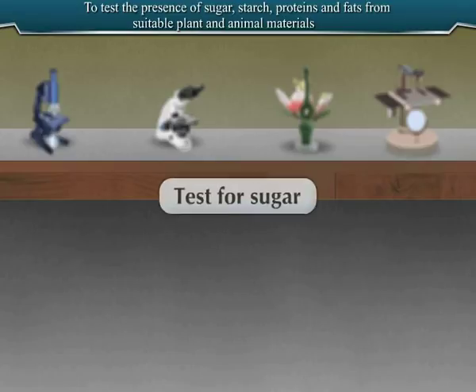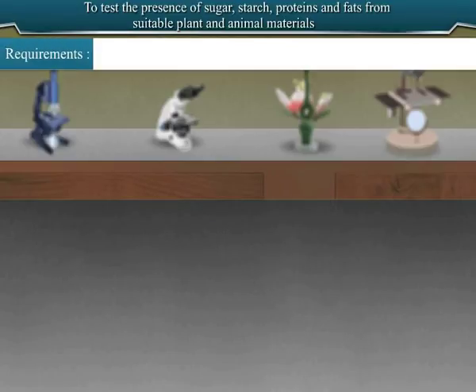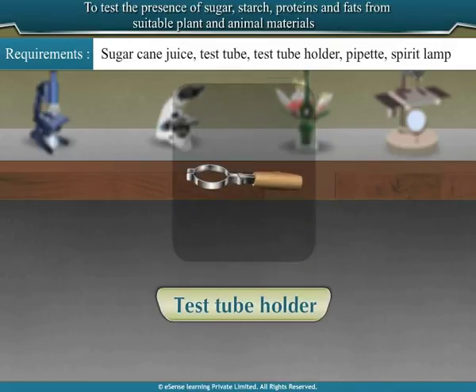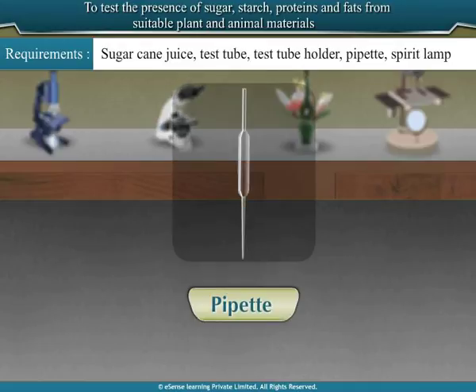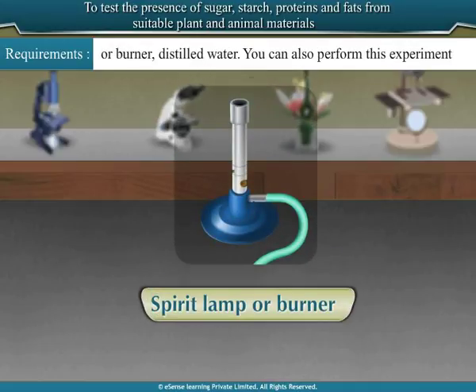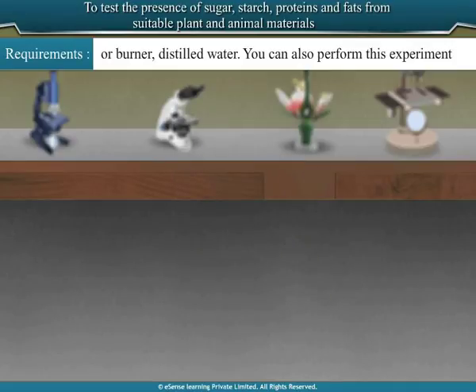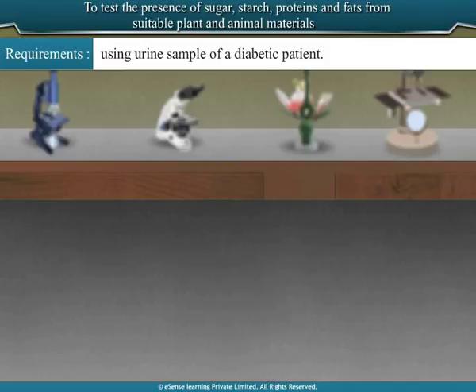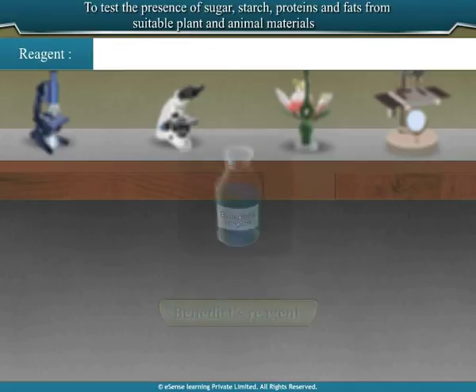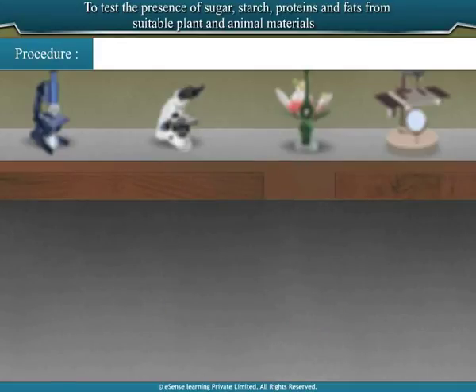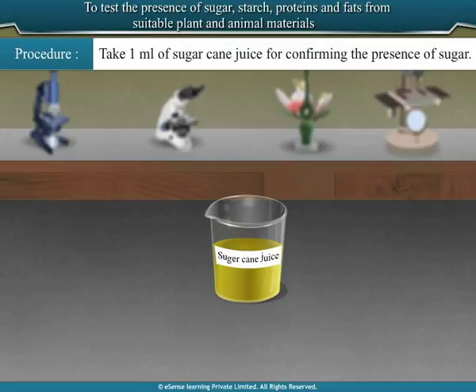Test 1: Test for sugar. Sample used is sugarcane juice. Materials required: test tube, test tube holder, pipette, spirit lamp or burner, and distilled water. You can also perform this experiment using a urine sample of a diabetic patient. Reagent: Benedict's reagent, which is commercially available.